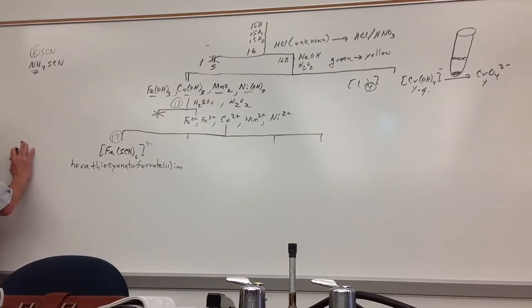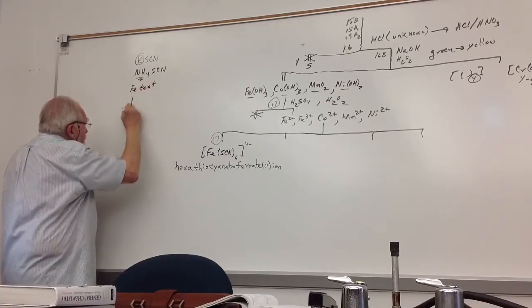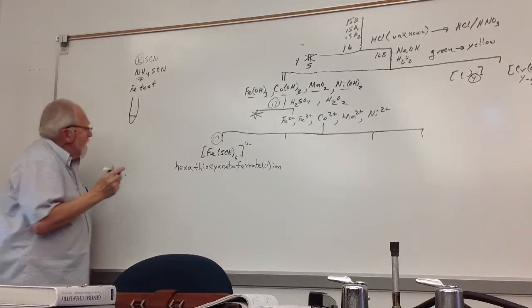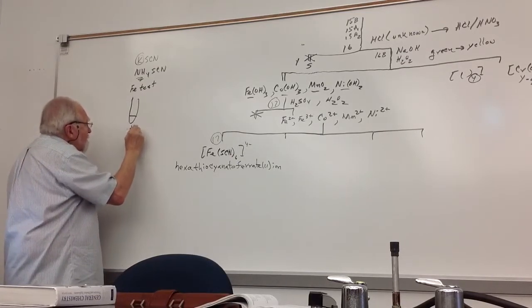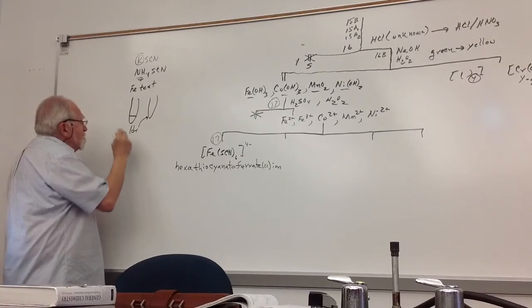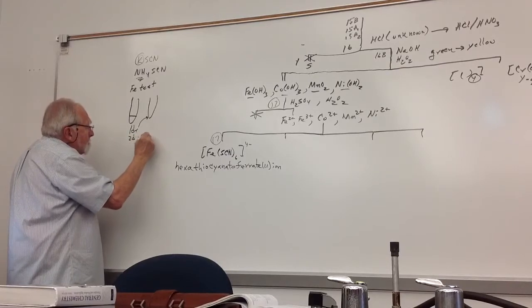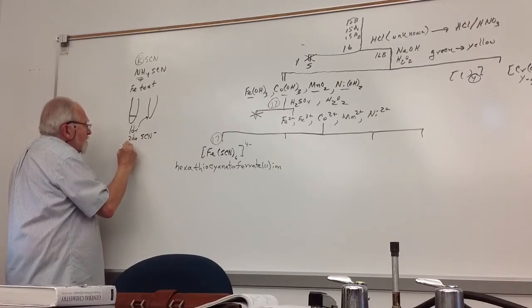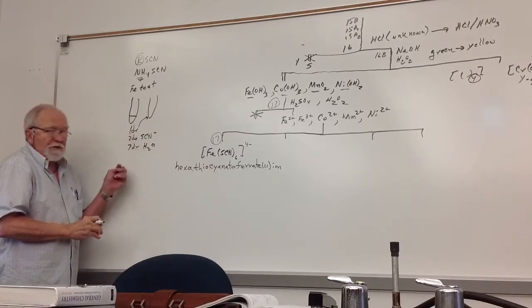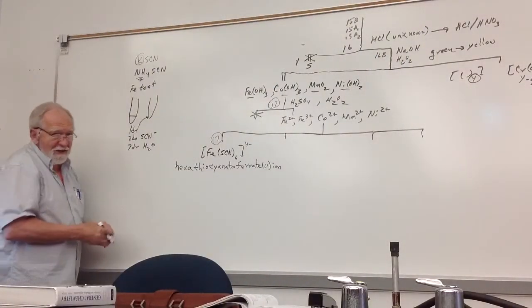So what I want you to do for part of the iron test, this is your original test tube. It's so dark you can't see through it. Then you take 1 drop of this and put it into a clean test tube. Then you put 2 drops of the ammonium thiocyanate reagent and 7 drops of water. You've diluted it by a factor of what? 10. That means it should look like a trace color.